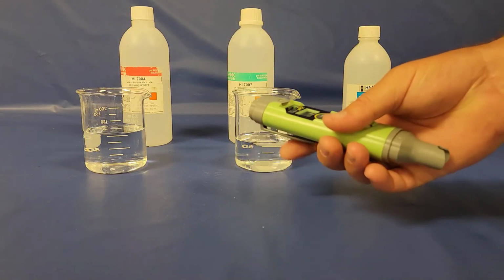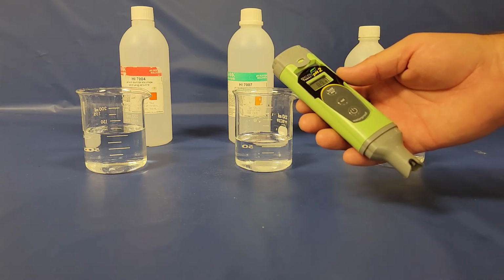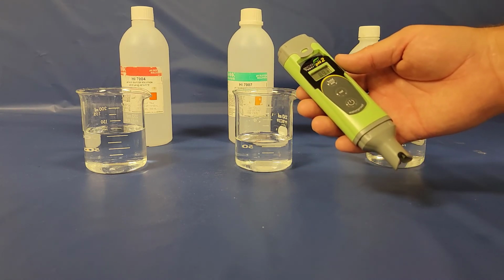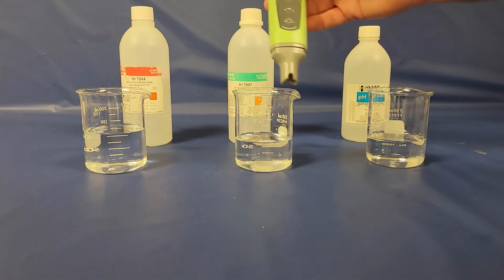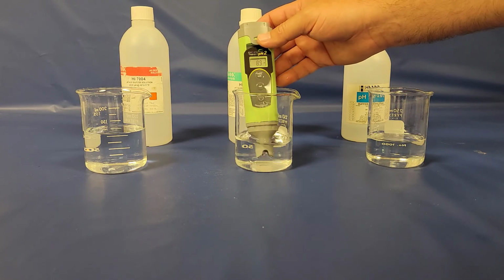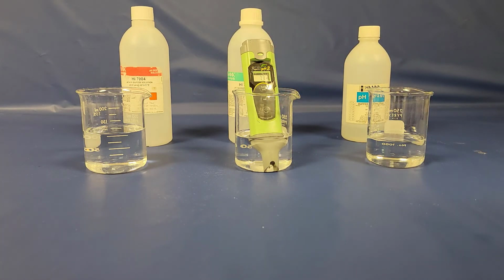All right, so let's go ahead and go through the calibration procedure for this particular unit here. In this particular one, we're just following the manufacturer's recommendations, just showing you what to do. So we'll start by putting it in the pH of 7 solution. So swirl it around a little bit, let it sit for just a moment, see where it dials in.